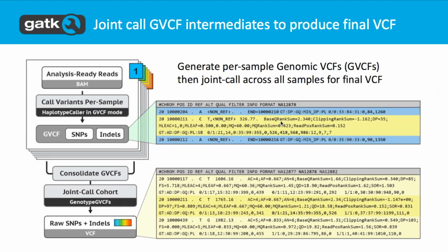So that variant gets interesting. Or in cases where you don't see any variant, how can you be sure that there's no variant in that position because there's actually no variant, or because sequencing didn't cover that region? So having information about each genomic location in your genome helps clarify those questions.